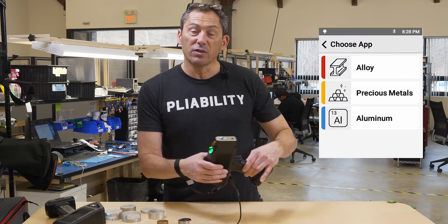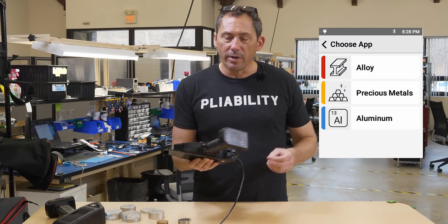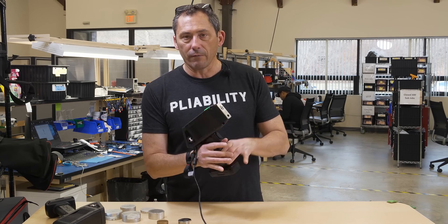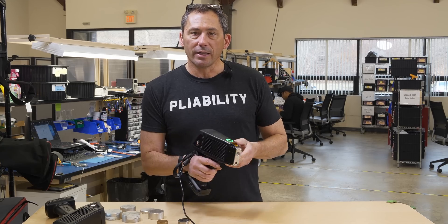It has a rear display, and it's also the lightest weight XRF ever made — 2.75 pounds. It has great balance, so you'll be totally comfortable using this thing all day long sorting metal.